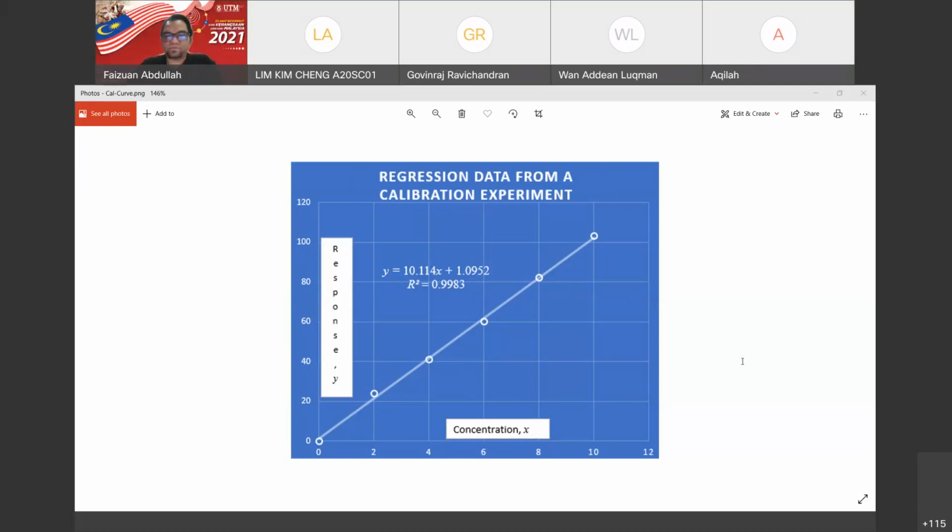Pure water, right? We are analyzing metal. We don't need any metals inside the distilled water, because it will disturb the concentration of the metals inside the calibration solution. That distilled water we consider as a solution without any analyte inside it.